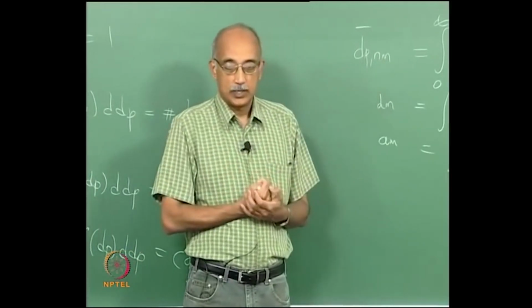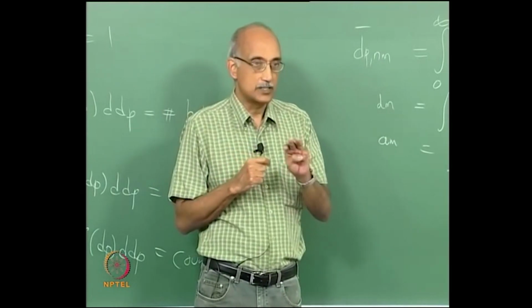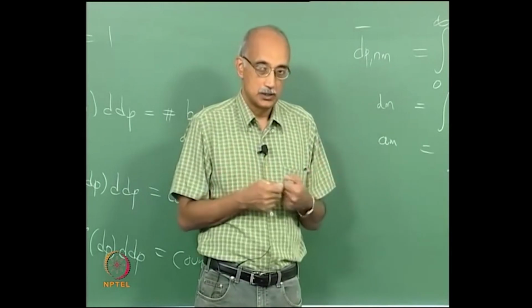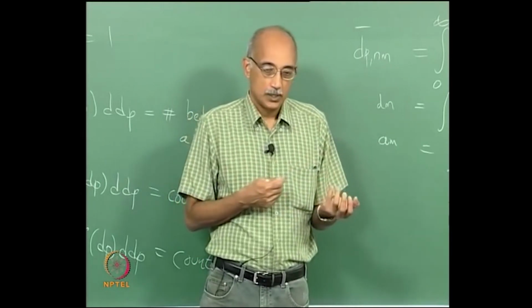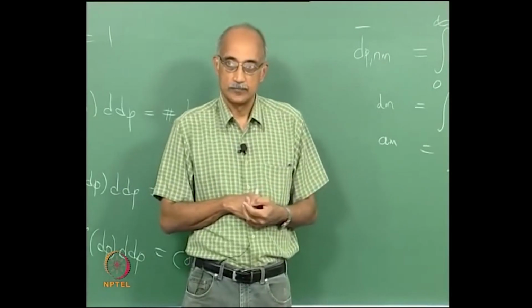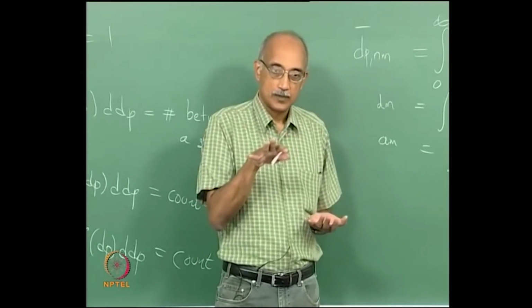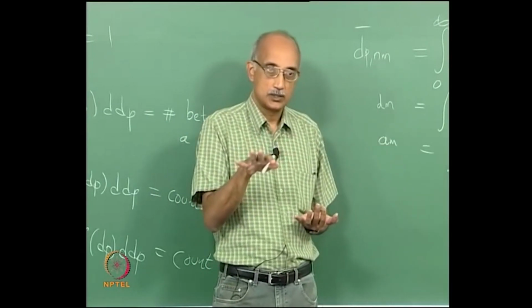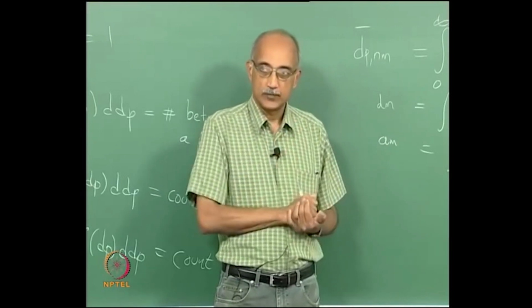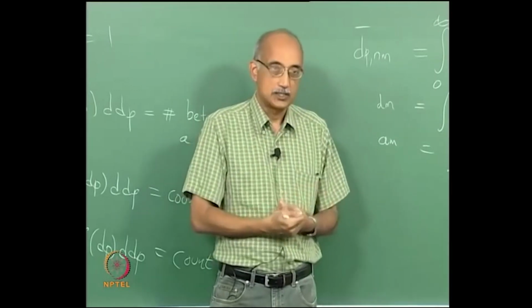What happens? Well, you have to imagine this as essentially three phases that are present now. You have the fluid phase, you have the particle phase, and then you have the sound wave that is propagating through this suspension. The particles present in the suspension act as discontinuities, which interact with the sound wave progressing through the fluid, and they cause the sound wave to be scattered.